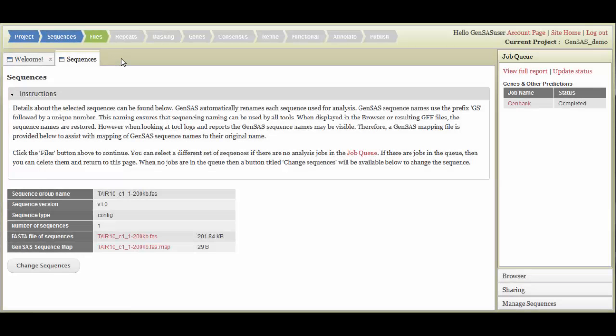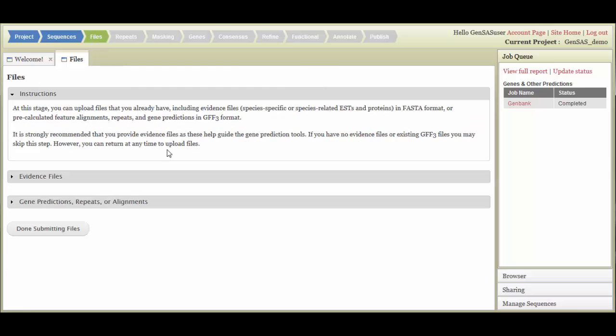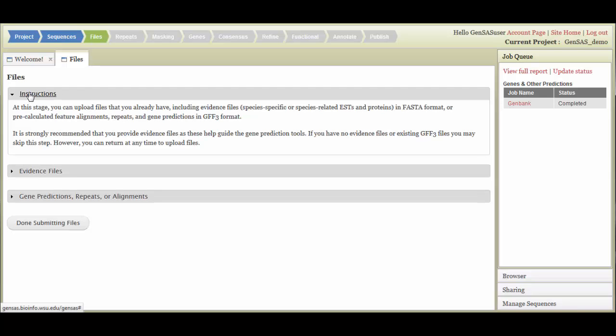To begin the next step, click on the Files arrow to open the Files tab. This is where you can choose to upload supporting data files for use with the annotation tools and WebApollo. Addition of supporting files is not required, but highly recommended, since this information will improve the annotation quality.